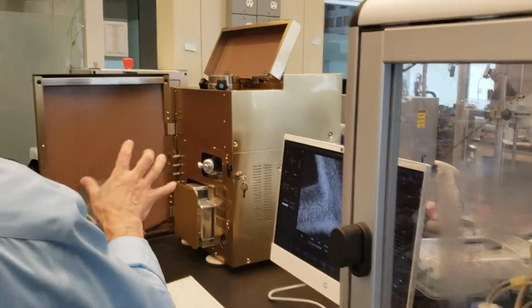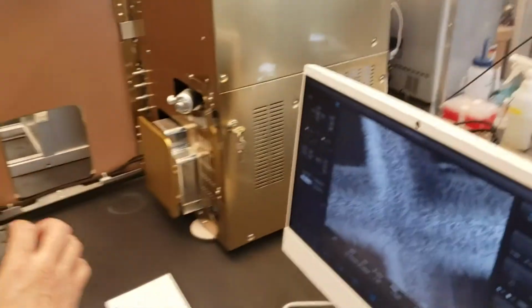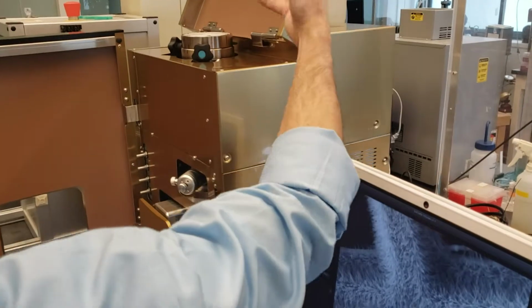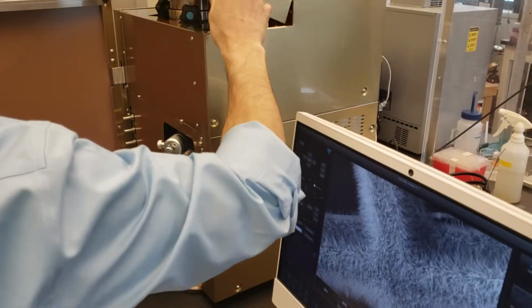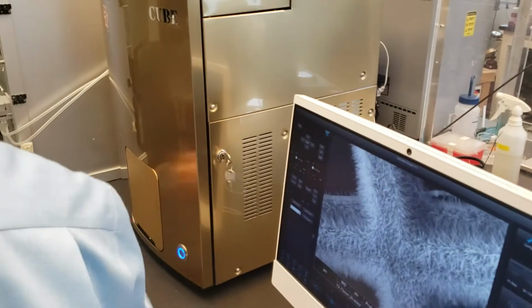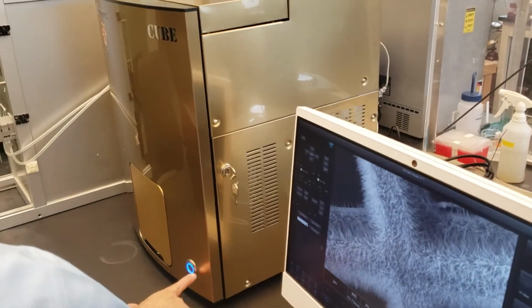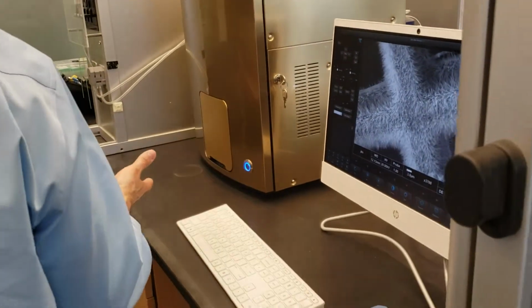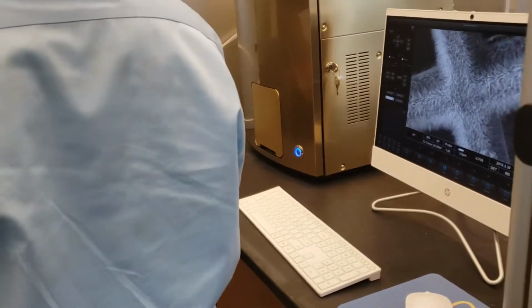So that's me kind of skipping around just a little bit, showing you, okay, this is our electron microscope. These are the covers that are exposed, but realistically you could leave all your covers on and closed, right? And if you vent it, you just open up the door, put your sample in, close the door, right? And this is your power switch, just on or off. And you could leave this microscope on or off. I don't know how to tell you to run it.